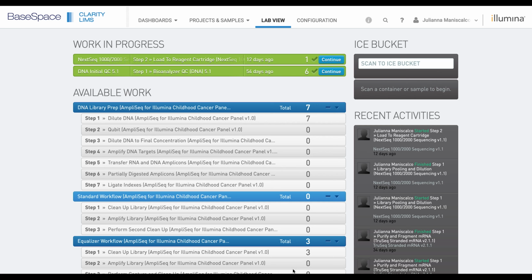A genealogy starts with a submitted sample and progresses with nodes nested beneath it. Information is displayed in a hierarchy and shows parent-child relationships between these nodes. For example, a derived sample may be an input to a step that produces derived sample outputs. This sample output is then the input into the next step in the workflow.